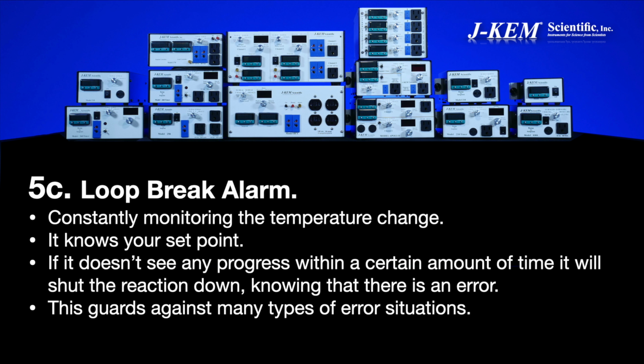We've also seen it valuable in cases where you're doing a reflux reaction. You lose cooling water. Well, if you boil away enough of your solvent, now the thermocouple is no longer in solution. It's just in the air of the reaction, and its temperature will go down. And even in that case, the loop break alarm will turn off heating. Basically, you have to stay at your set point, and if something disrupts that process, it just monitors, is my heating system intact? If I put electricity on this heater, do I see a change in temperature?